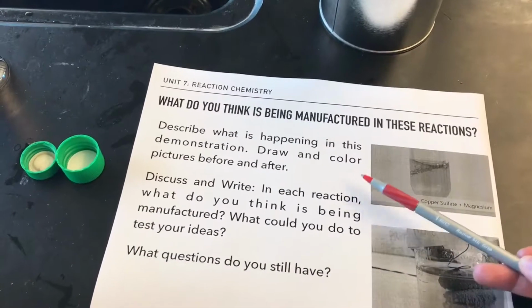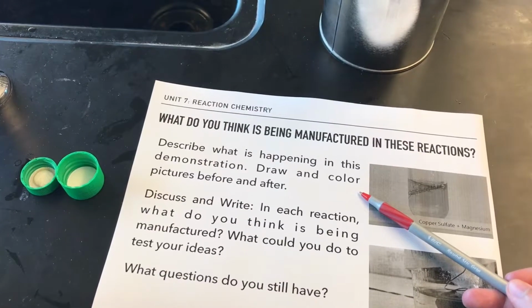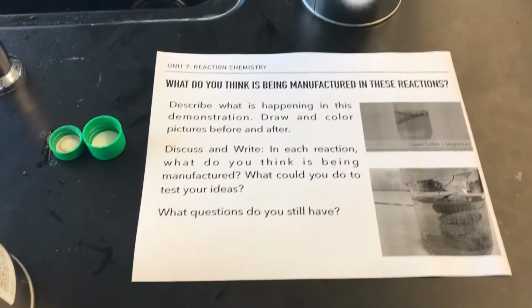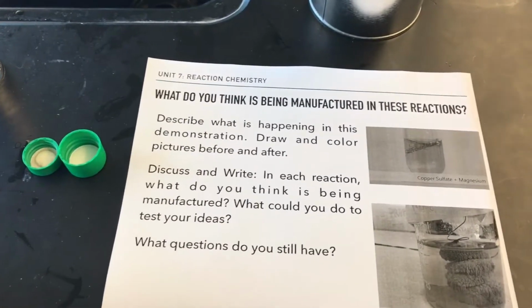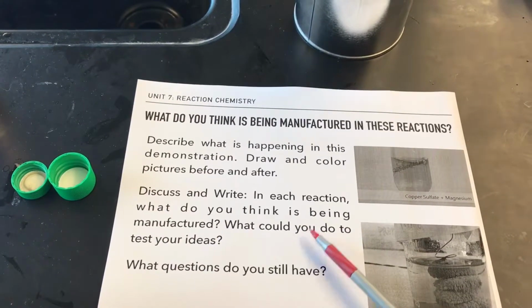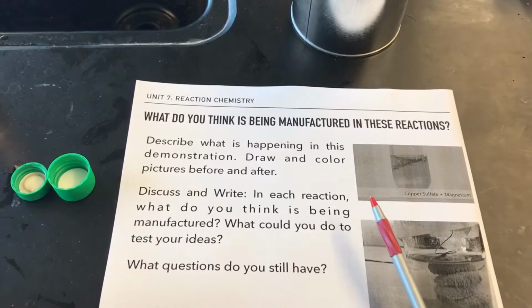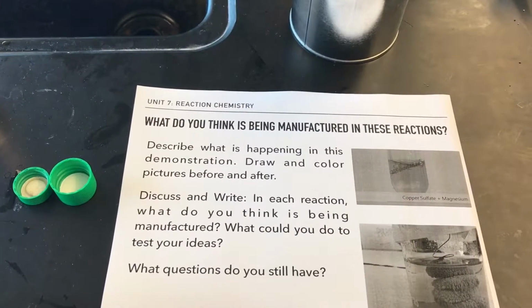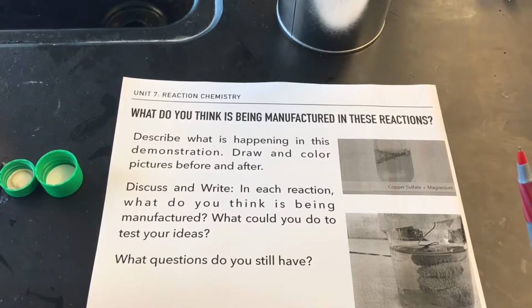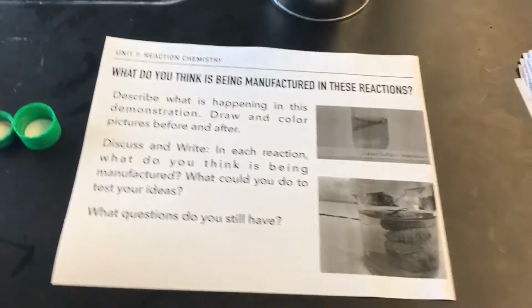So what's going to happen is I'm going to show you the materials before they start, and then you're going to have a picture of what's kind of happening during the process. And then I'm going to take them out and we're going to look at what they look like after the reaction is done. After you've done that, you're going to discuss and write in each reaction, what do you think is being manufactured? And then what is one way that you could test for what you think is being made? So what could you do? What's some test you could perform to figure out what the identity of the substance is? And if you have anything else at the end, it's what questions do you still have?